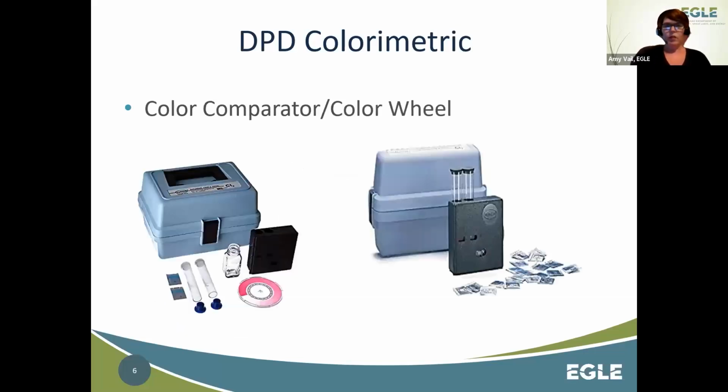Since this is using human sight, what one person sees as, oh, this is what I'm looking at, another person might see, well, this is what I see. These two look the same. And so, depending on who's reading the test, you might get different results.